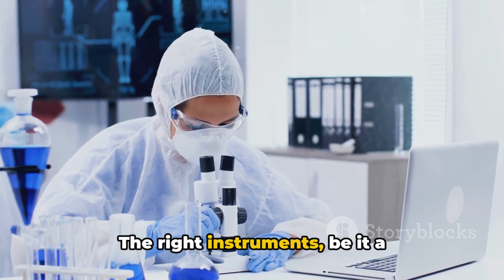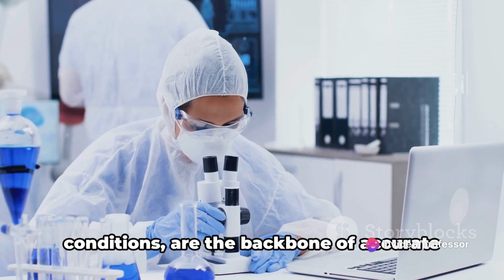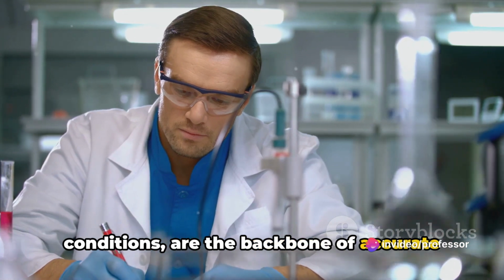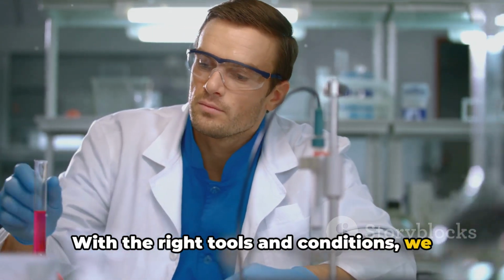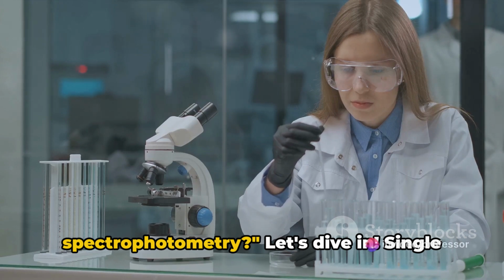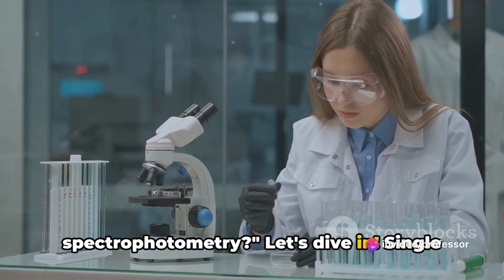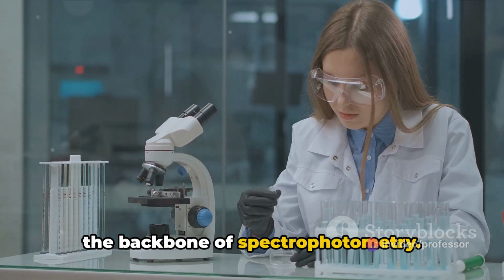So there you have it. The right instruments, be it a single beam or a double beam spectrophotometer, coupled with optimum conditions, are the backbone of accurate spectrophotometric measurements. With the right tools and conditions, we can now explore the methods of analysis. Ready to learn about the different methods of analysis and derivative spectrophotometry? Let's dive in. Single and multi-component analysis methods form the backbone of spectrophotometry.